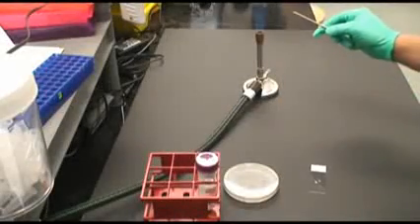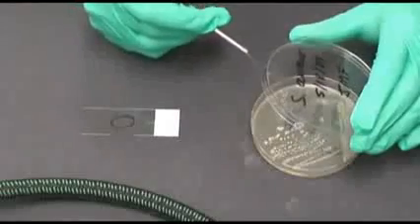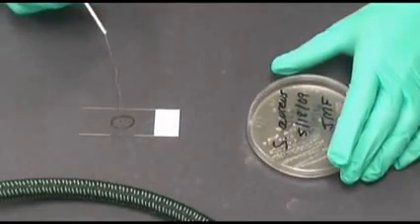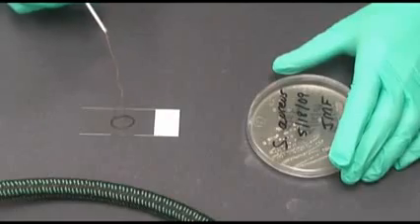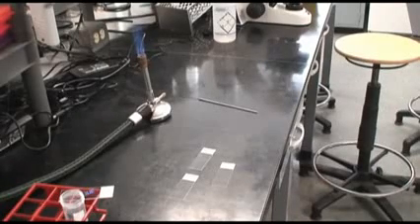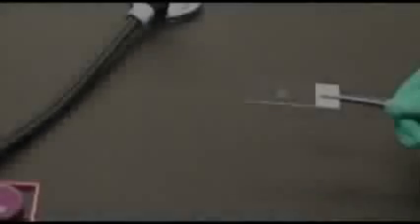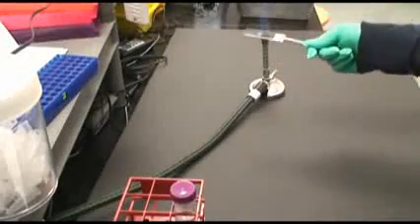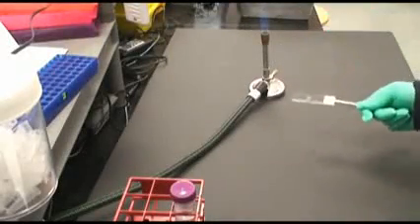Sterilizing the loop between each transfer, add a small amount of gram-positive and gram-negative bacteria to the same slide, ultimately smearing the two bacteria together. For some labs, multiple Gram stains will be completed, with some of the slides containing either gram-positive or gram-negative bacteria. These other slides will act as controls for the slide containing multiple types of bacteria. Once dry, the bacteria are killed and fixed to the slide by passing the slide through a flame. Make sure that the bacteria never come in contact with the flame.